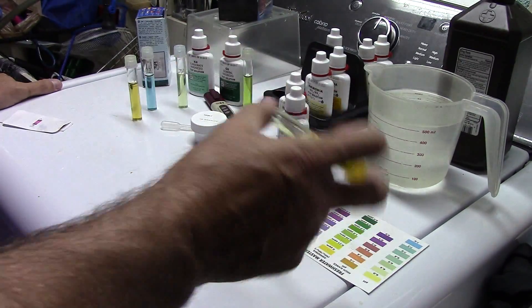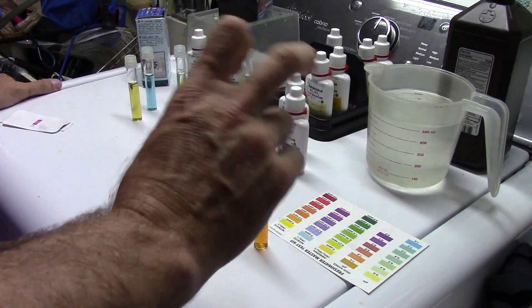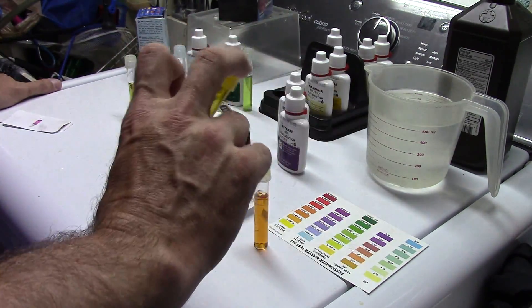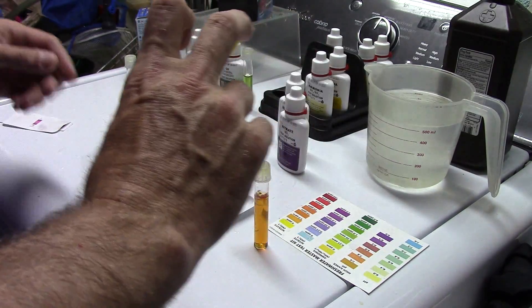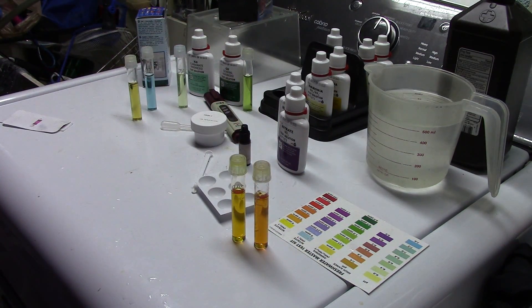We are down to the last few seconds of doing this, and you can see the water in these vials is already starting to change color. This is going to be water from the fish store.